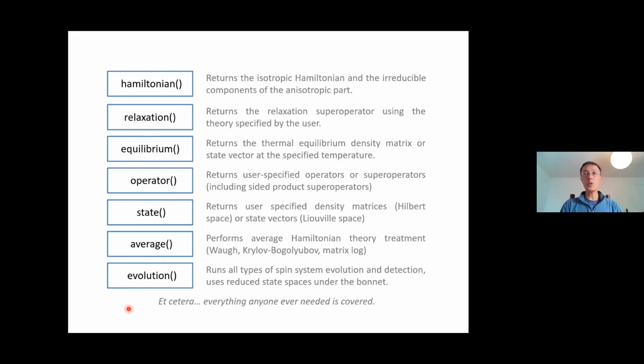There's also the user end interface, where all of this complexity is hidden and the pulse sequence is pre-programmed. Like you say, okay, Spinach, I want a COSY, and press the button, and it'll say, okay, but what's the sweep width, and so on. And as soon as you supply all the reasonable things that you would tell a spectrometer, it will run you a COSY and not ask too many questions.